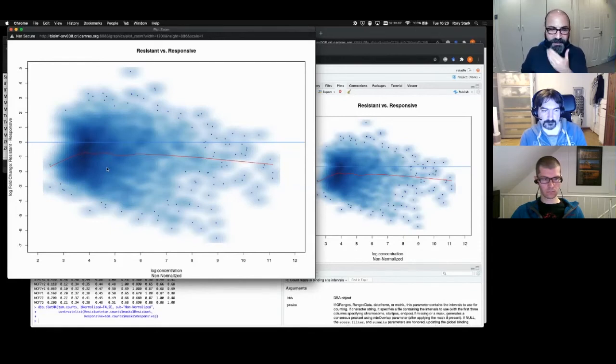There's other plots we can do, for instance, in the vignette where you could see a trended bias. That's something that is technical, where the bias in fold change is correlated with the concentration. So as you get higher concentration, you get a higher fold change. And that's often indicative of a technical issue, although it can actually still be biological. The hard part, as I talked about yesterday, is knowing what's a technical bias and what's a biological result.